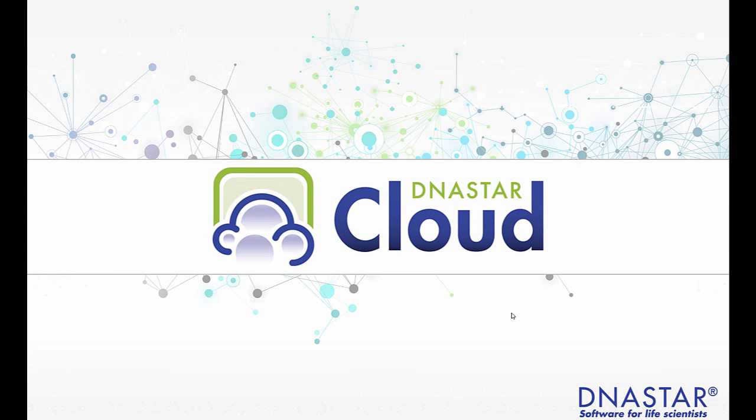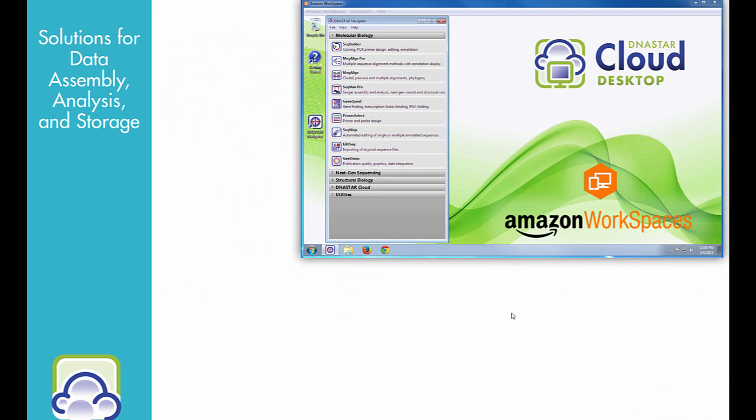So the DNASTAR Cloud is hosted by Amazon Web Services, and it's comprised of three major products. First, our DNASTAR Cloud Desktop allows you to do all of the analysis you would do on a physical desktop computer using a virtual computer and accessing that computer through the Amazon Workspaces app. So if you're not familiar with Amazon Workspaces, this is an app that you would install on your Mac or Windows computer or on a mobile device such as an iPad or Android tablet. And then from there, you can actually use the software just as you would on a normal desktop computer. So this is a really nice option for people who are away from their computers or need an option to collaborate directly with peers. The cloud desktop on Amazon Workspaces is something to look into.